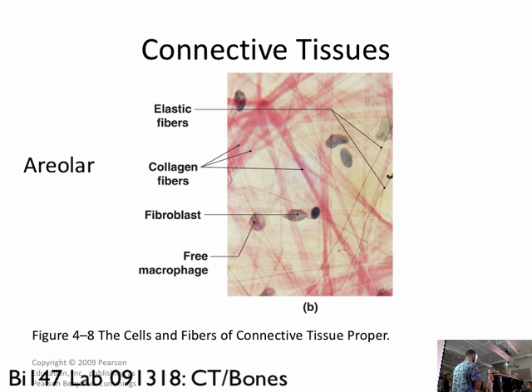It's amazing. Microscopy is so magical. I think it's magical. Alright, so these elastic fibers that you're seeing are like rubber bands. They're made of a protein called elastin, which we'll talk about in class, but they're super stretchy. You can stretch them, and then they'll bring the areolar tissue back to the shape that it was at previously. Then there are what are called collagen fibers. You'll notice the elastic fibers are the dark, really thin lines. They're darker than everything else in your slide, and they're thinner than everything.